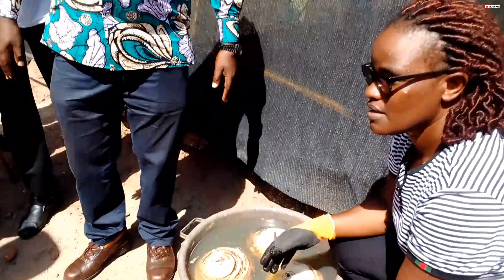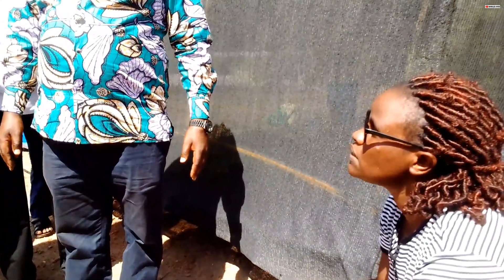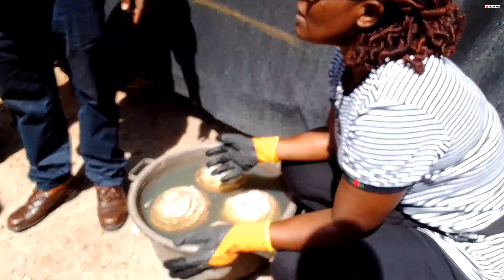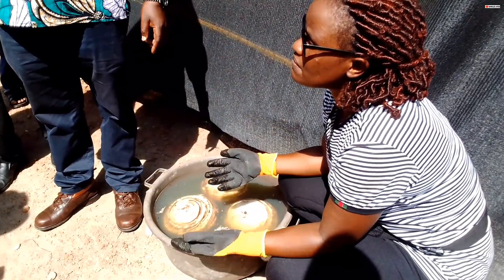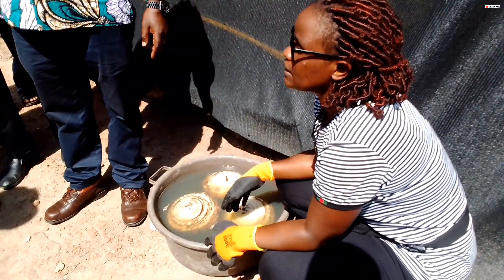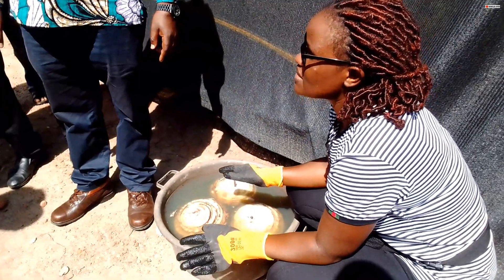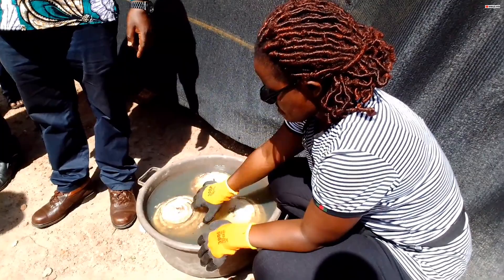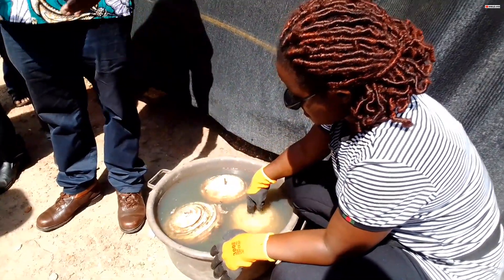Which kind of disinfectant do you have inside? Sometimes we use Mistrace, Fungocil, or Mancozeb — provided as a fungicide. Yes, as long as it's a fungicide. For disinfection, 30 minutes.